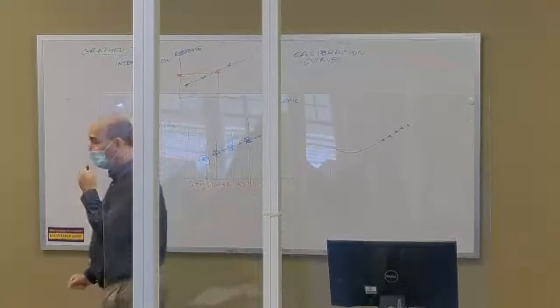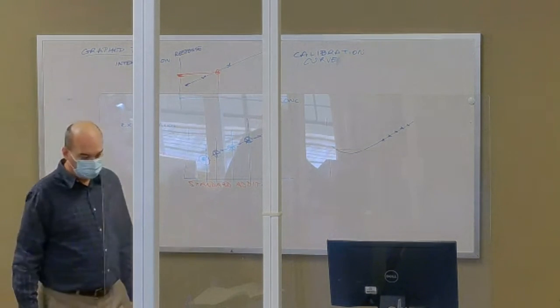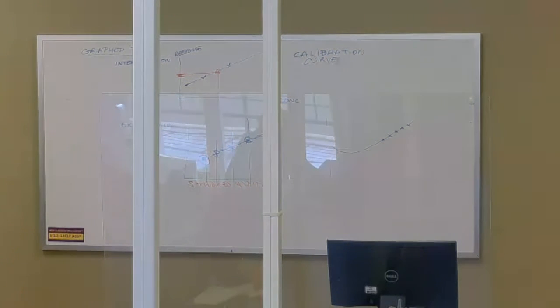And the other thing that we can have, that really I'm going to leave until the instrumental course. Right here we've got an NMR. And the NMR scale runs between 0 and 10. The frequency scale is called parts per million. But our samples, and this is one that's delivered to us from the factory, this one is sealed. Right? There's a little tube with solution in it, and it's factory sealed. So nothing's getting in and nothing's getting out. No contamination to this one.